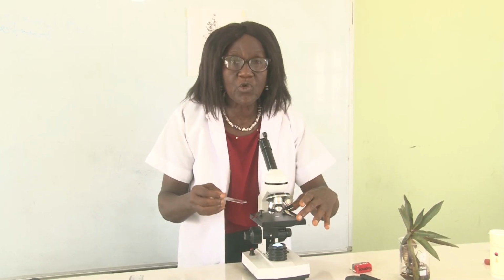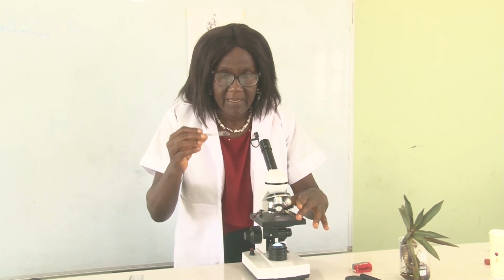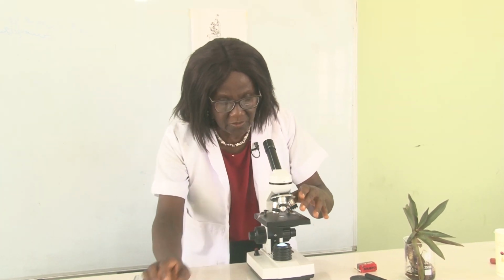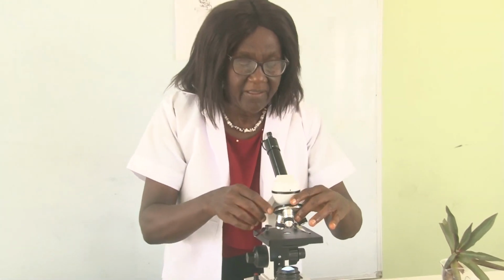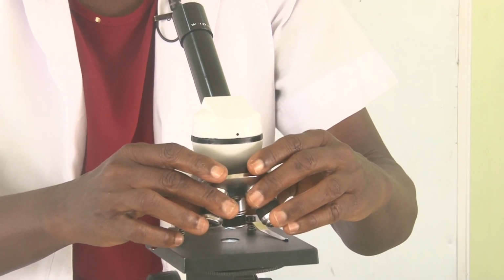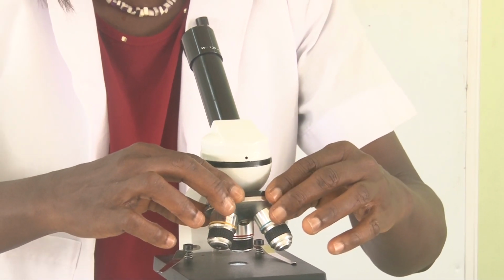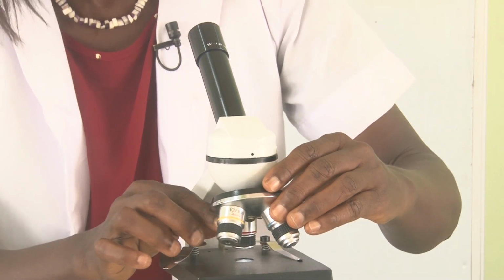Let's use our microscope to look at our specimen on the microscope slide. First of all, make sure that there's light in your microscope. Now, you need to bring the low power objective in line with the eyepiece. This is the revolving nose piece that turns from one objective lens to another.